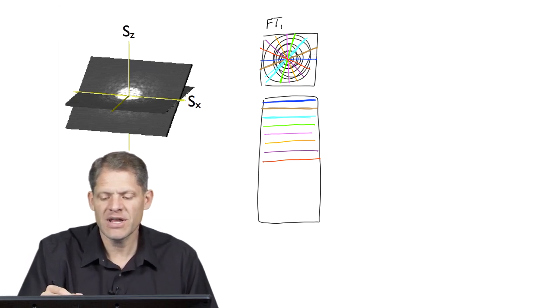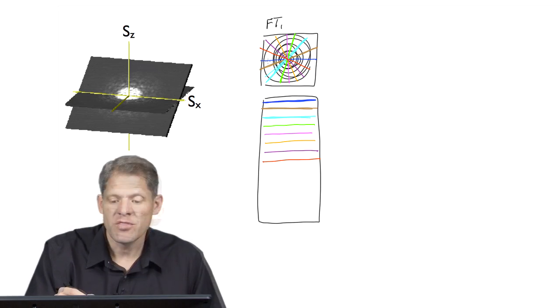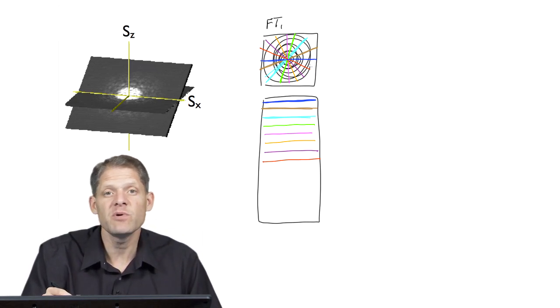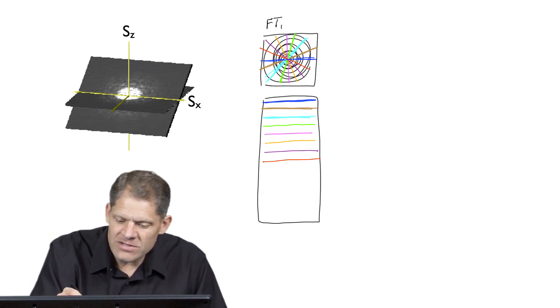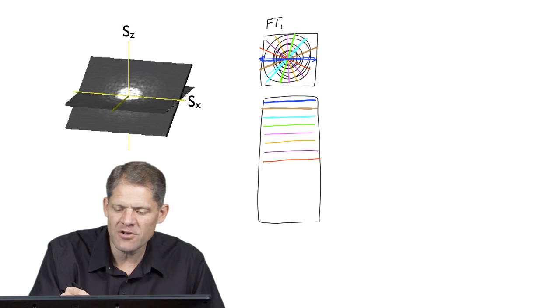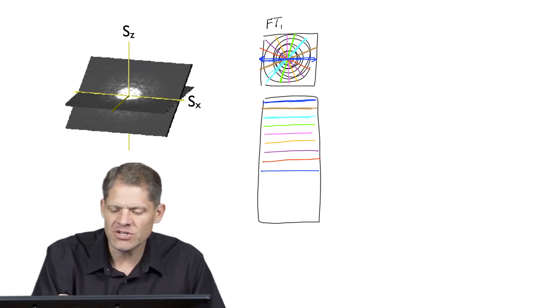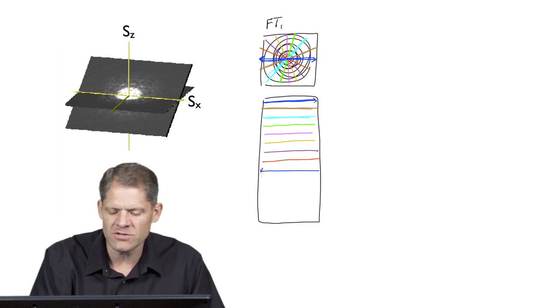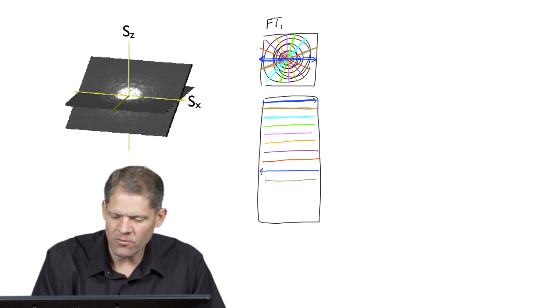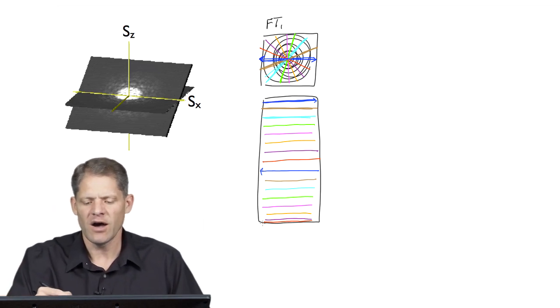Then once we get all the way around 180 degrees, we realize that the next one, were we to map it out, the first line had amplitudes and phases across the transform right there. And after we went around 180 degrees, we realized the next line, if we were to draw it, would be amplitudes and phases going across it in the other direction. I mean for those lines to be superimposed. It's just one is this direction, one is the other direction. So we can see that the next line we would write would have the same amplitudes and phases as this line, just in the opposite direction. In other words, this one's going that way, this one is going that way. And we could continue that all around the transform and replicate these values. My box wasn't quite big enough. I'm going to squeeze the last one in, but you get the picture of setting up this table.